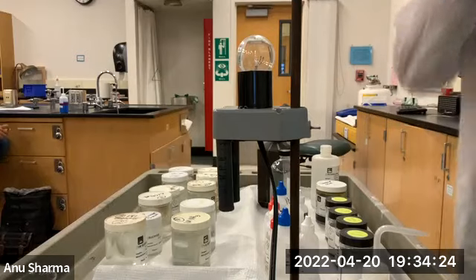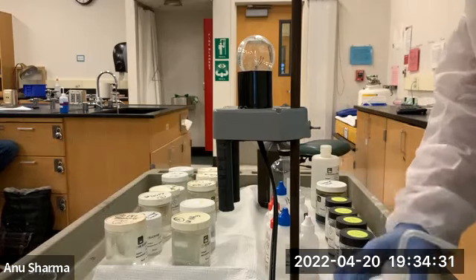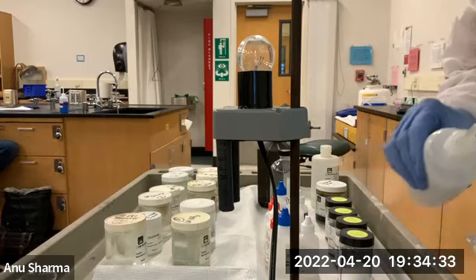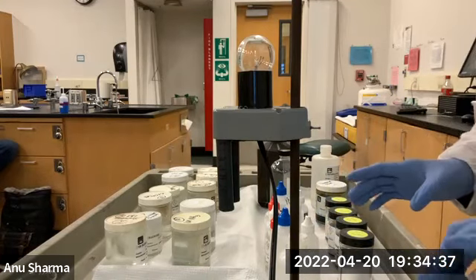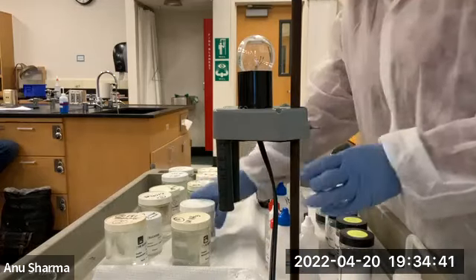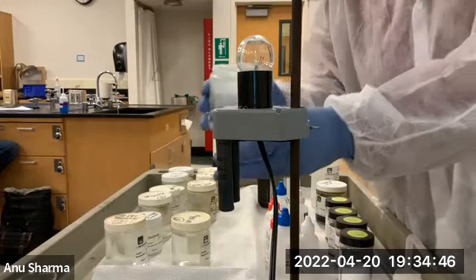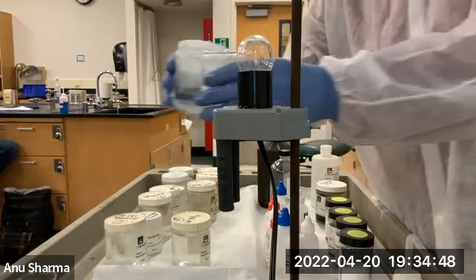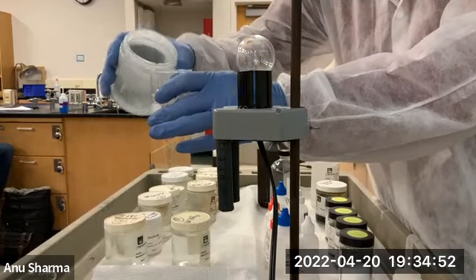Now comes the reaction where you mix the sulfuric acid with barium hydroxide. So let's do that. I'm taking this barium hydroxide and adding it to this piece, a little bit here.